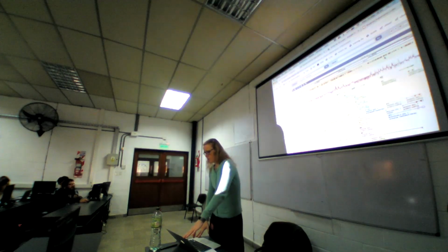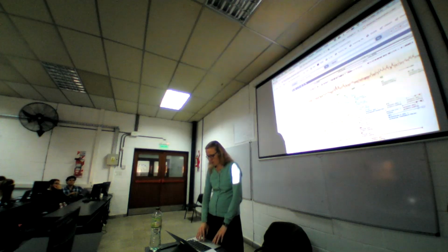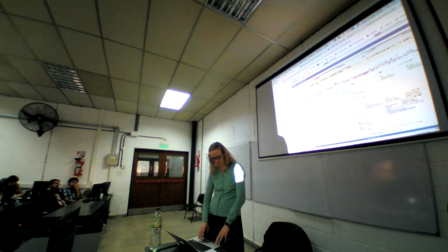And what you can hopefully see looking at the pattern of these scores and the elements and how they line up to the exons is that the coding regions, say here, are more conserved than the non-coding regions. Yeah, it gets a bit busy with HOXD by now, but so here's the one exon here where you have that peak and then the constrained element here, for example.